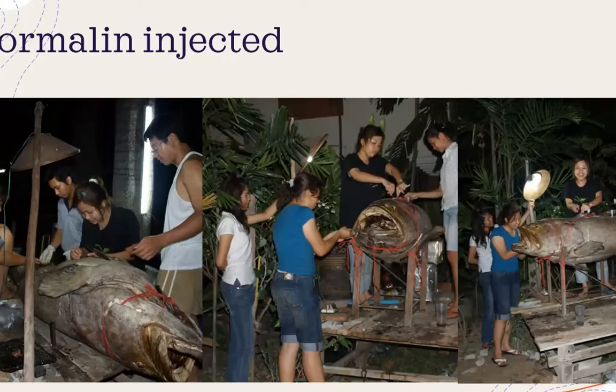How to make the skin dry? If you don't do it like that and around 3 days it is not yet dry, you are going to incubate it somewhere with a hot plate. But then the condition of the skin is not so good anymore, and maybe it's not so good when you preserve them.